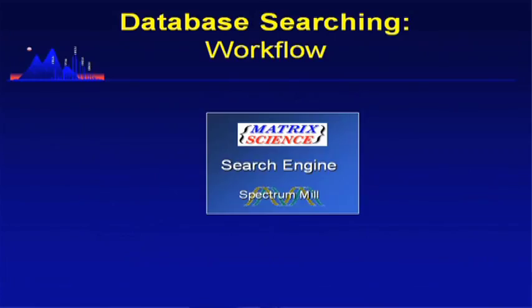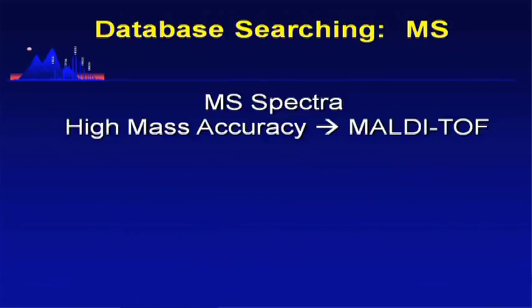All right, so we're going to talk about the search engines now. We have these databases. They have lots of information. We're about to go searching. So how does database searching work? There's two types of searches you can do.